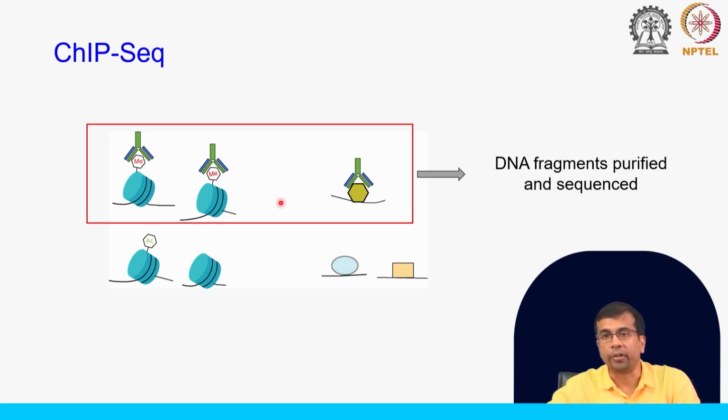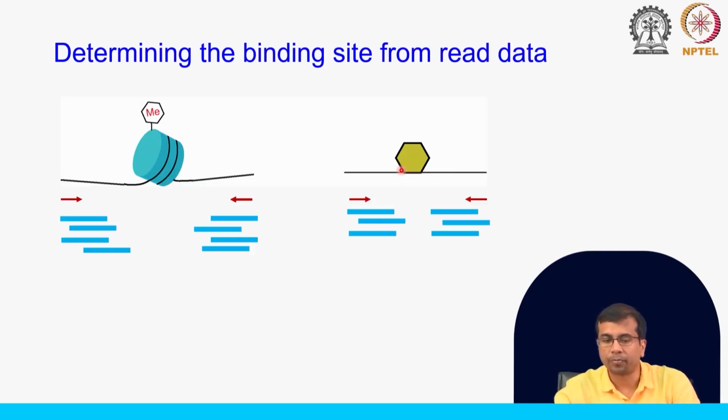Okay. So, when we do the sequencing, now we are going to describe the next steps. We have done the sequencing, what is the challenge now? Let us say we take both these examples and illustrate what the challenge is here. So, here is, let us say, the first idea. Here we have done the sequencing from both ends. This is paired end sequencing in any platform that we like, and once we do the sequencing, what we will end up with is a bunch of reads here. Okay. So, this is something that is important for us to understand when you go into the hands on, etc.